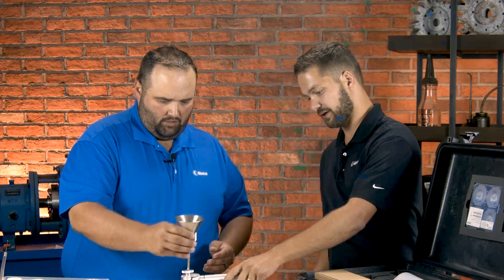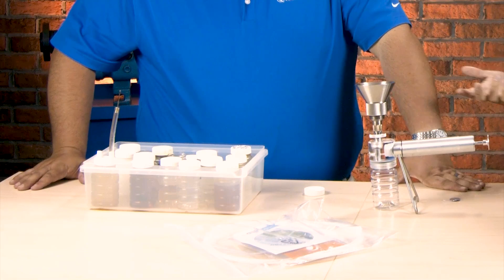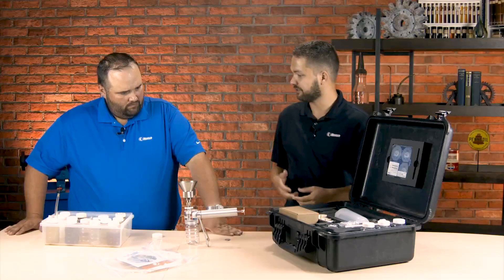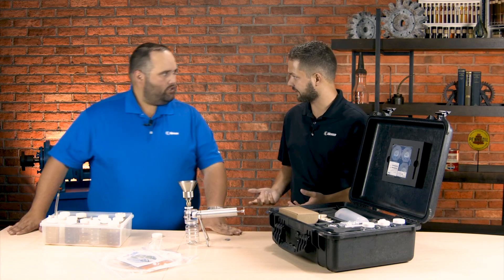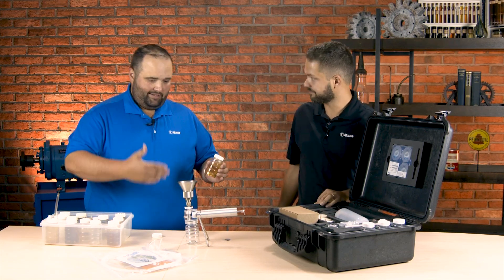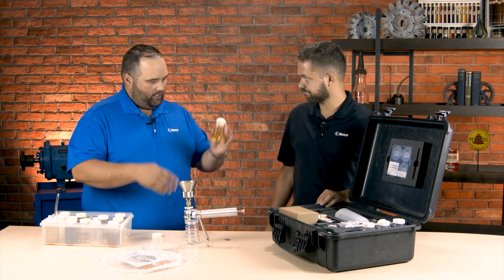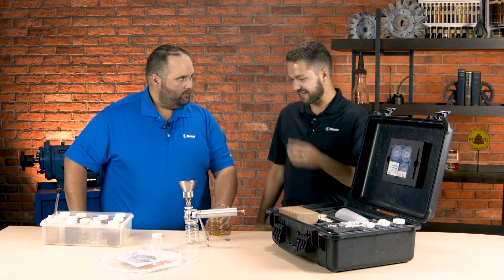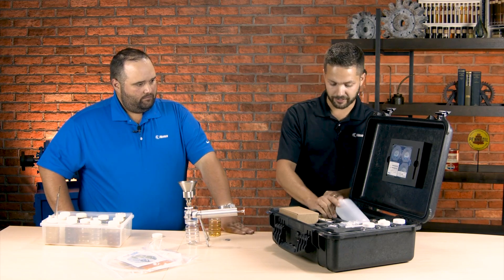Let's assemble this a little bit real quick — that would go right there. Pretty straightforward. But before you actually take a sample and put it through here, you have to put a little bit of solvent in there. A common solvent would be like a mineral spirit, because if you have a sample that's thick, it may not go through very easily. So you do want to use a solvent to kill the viscosity a little bit. And if it's heavily contaminated, that can make it difficult to push through, so the solvent helps with that.